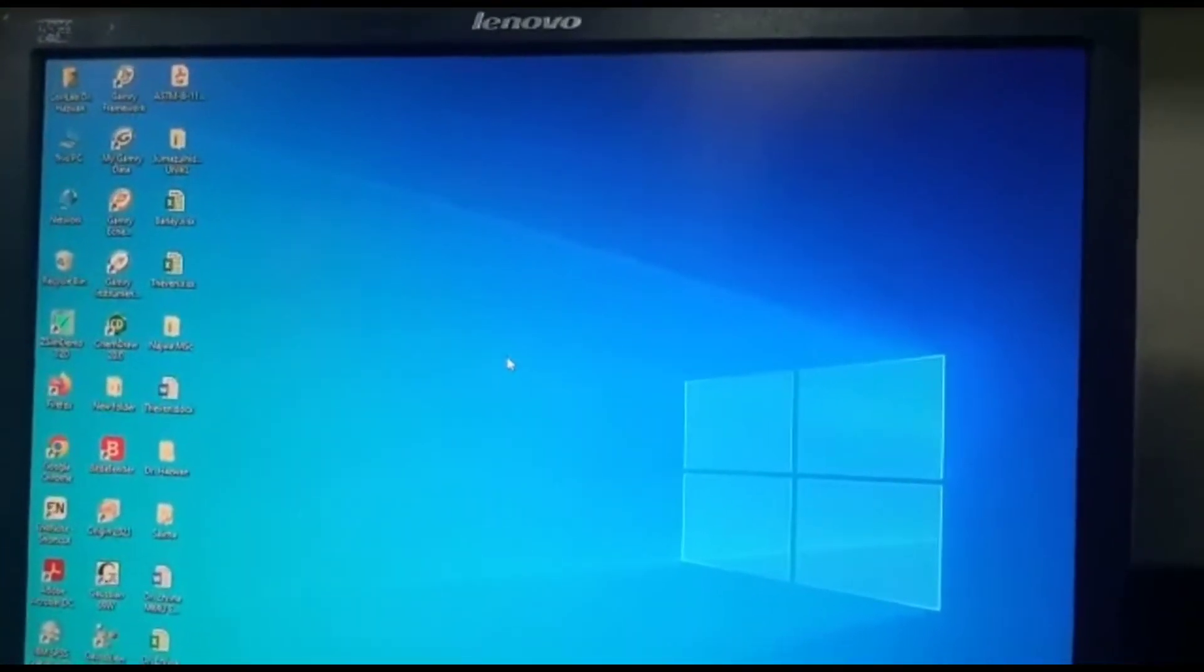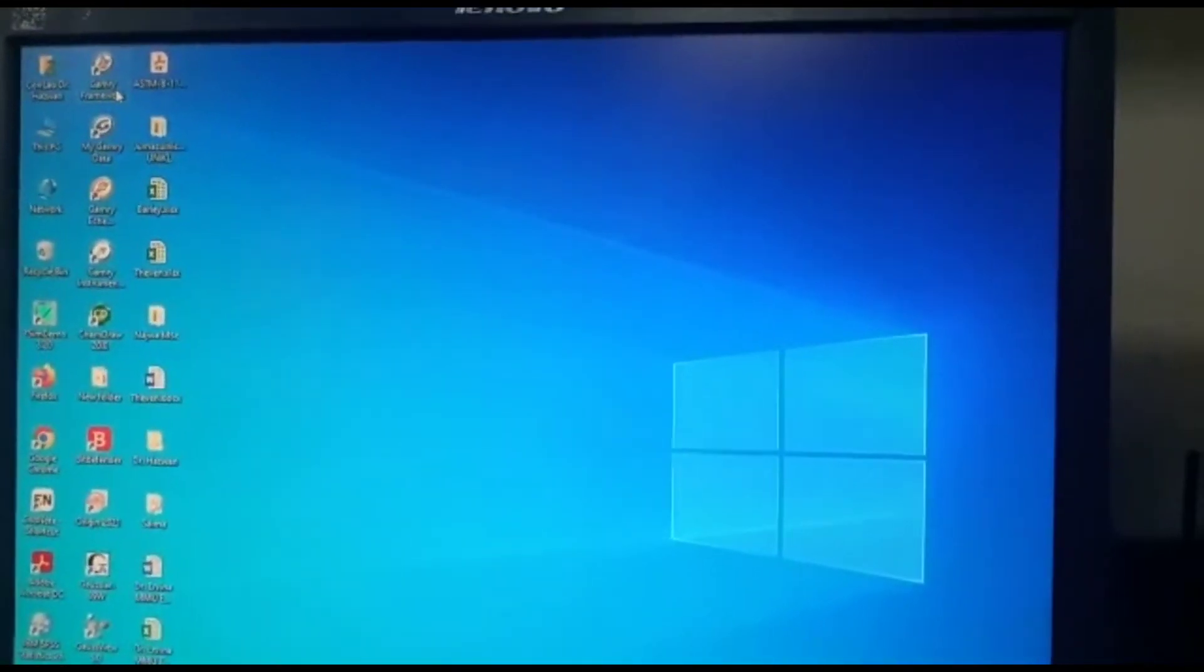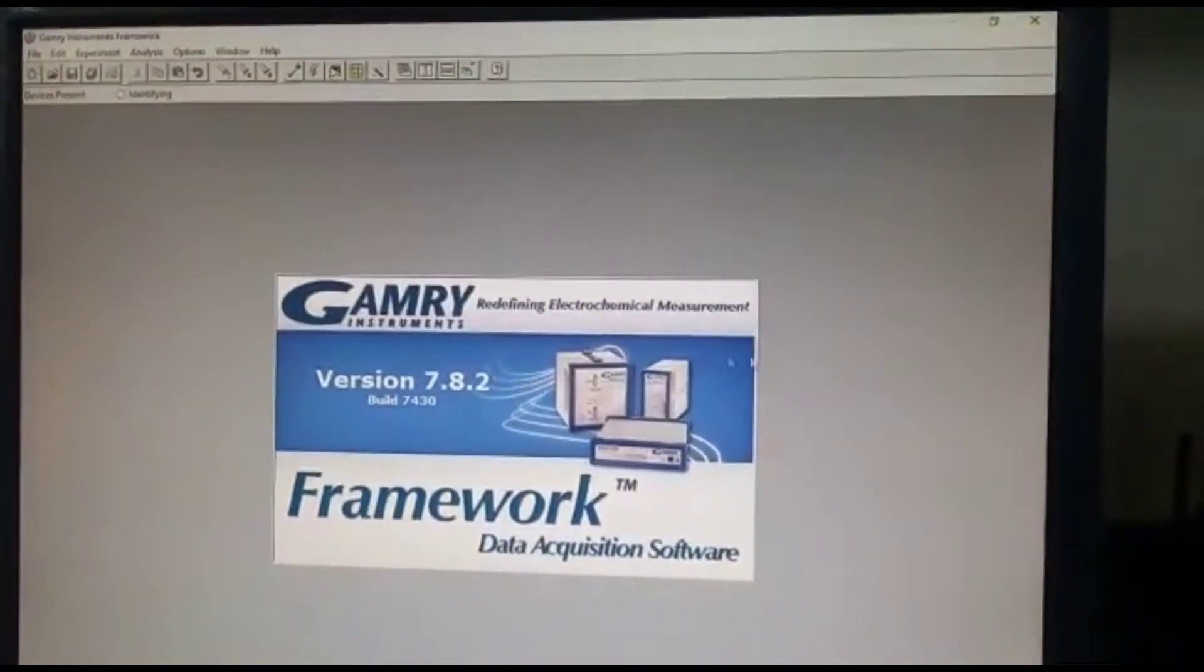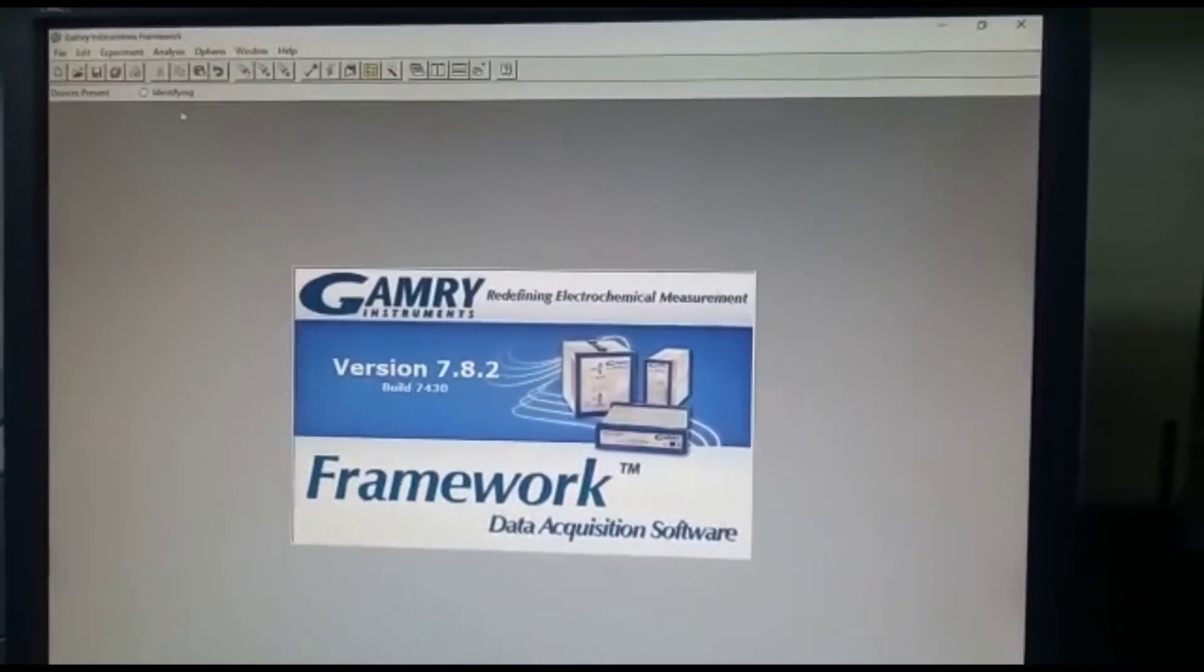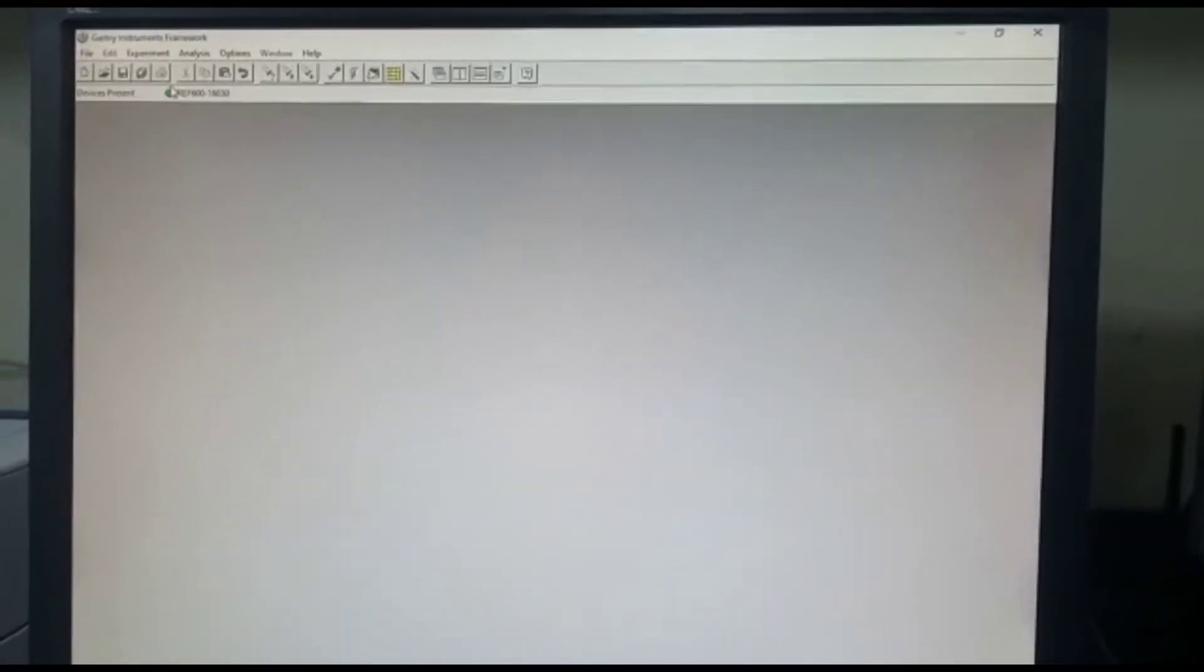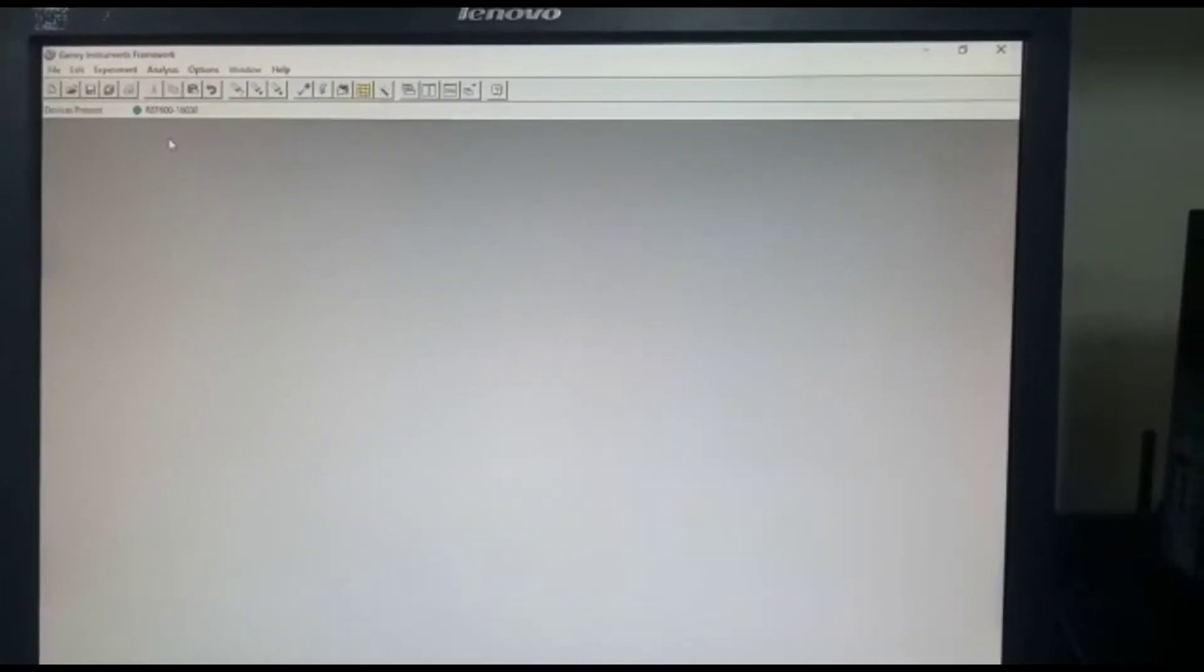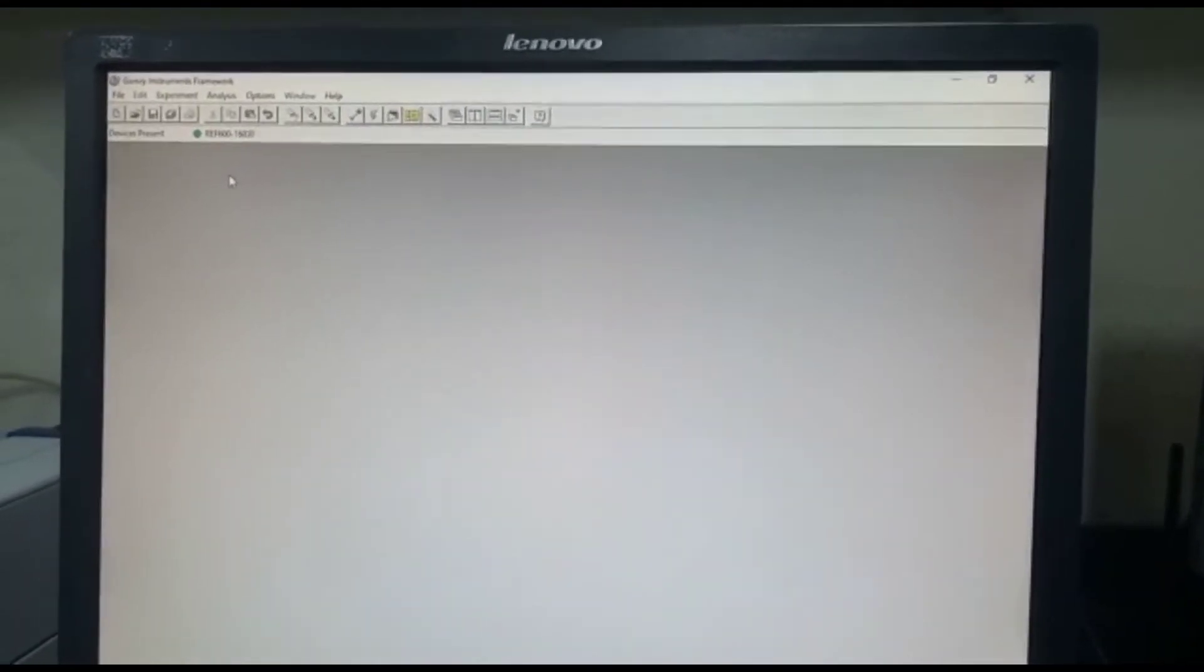Okay, so now once we have connected the microbial fuel cell to the potentiostat, we are going to go to the Gamry Framework. So this is actually the software used for the analysis. So when we click to the application, you will see on top whether the device is present or not. So we waited until it becomes green. So green means that the connection between the potentiostat and the system is okay, it's good to go.